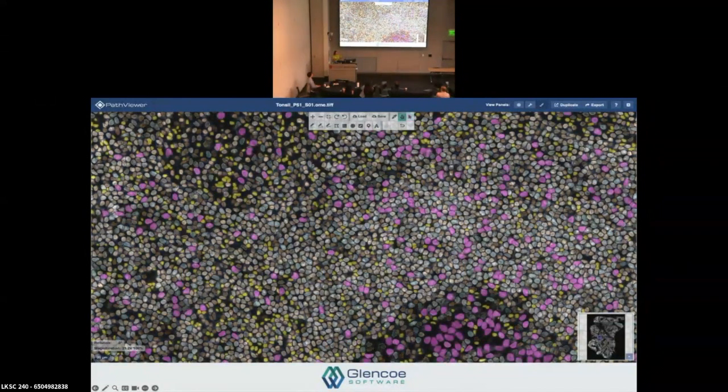And then you might take those results and you might say, okay, I have previously a more continuous view of blue to brown, what were the size of the objects. But now I just want to create a classification. I want to find my big objects and make them magenta, and I want to find my small objects and make them yellow. And now I have two classes of objects that I'm looking at on my image. And this works very nicely when you have large numbers of objects that are classified as big or small. But you might be looking at rare populations within your image. It might not be as simple as looking for the big and small objects.